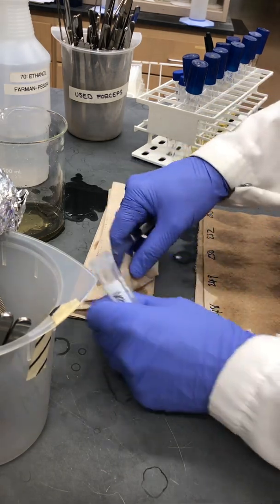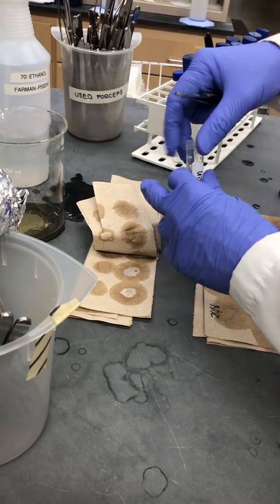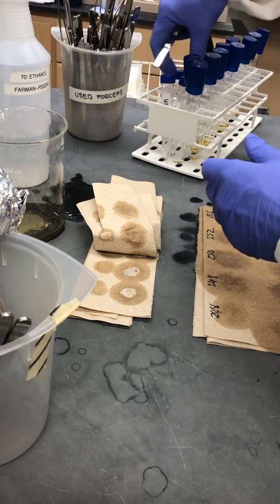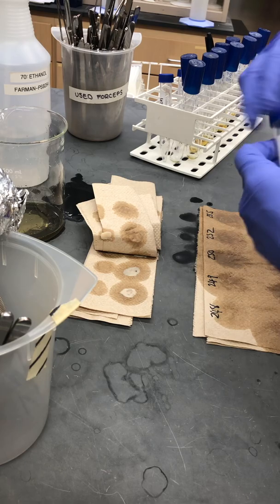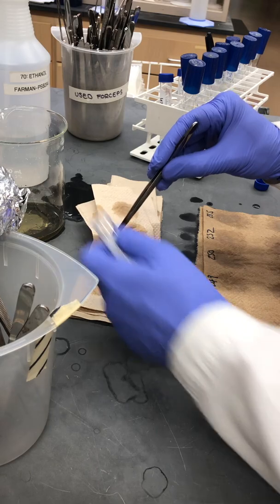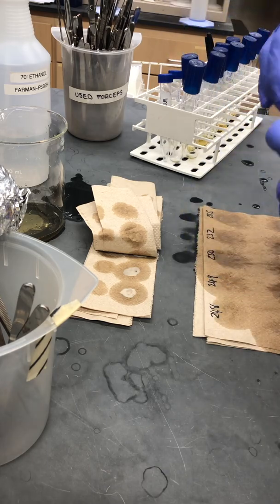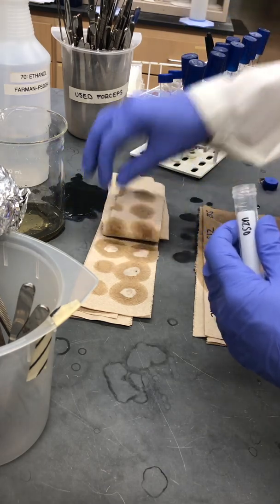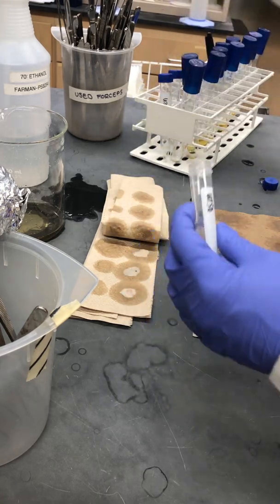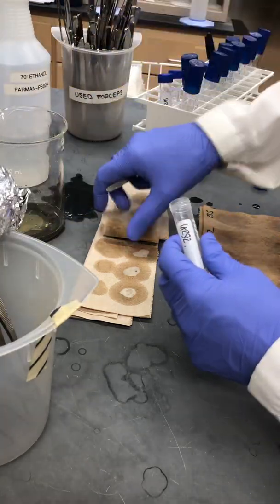When they're dry, we can start transferring them to their respective tubes. I'm just going to cap these very loosely because we're going to freeze dry them and we want the moisture to be able to escape from the tube. Of course, I've got all my tubes labelled correctly before I started, to make the process more efficient and less prone to making errors.